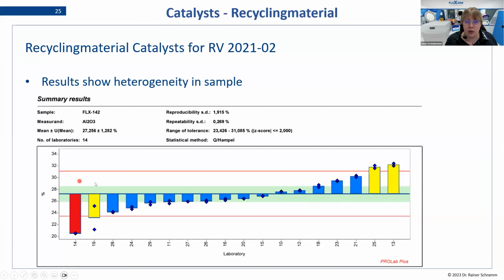And here we can see very nicely that the heterogeneity in the sample makes it very hard to see how the laboratory performed in reality.